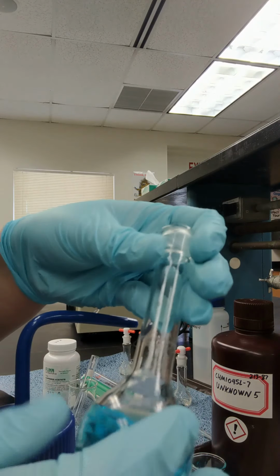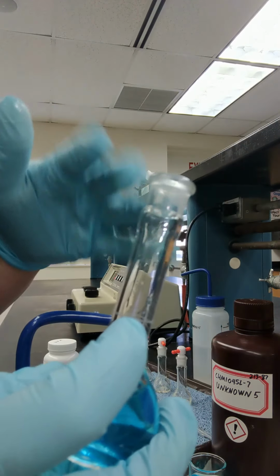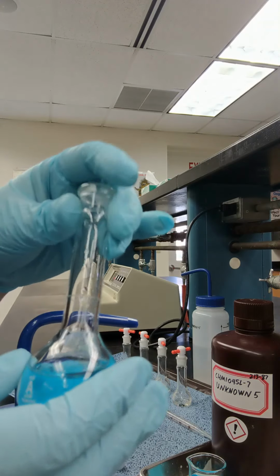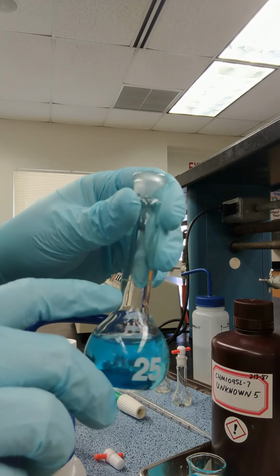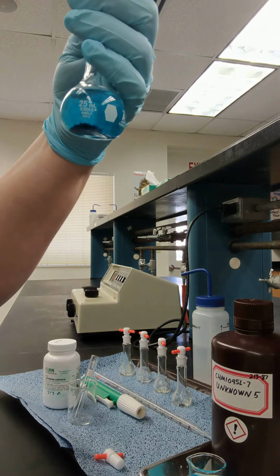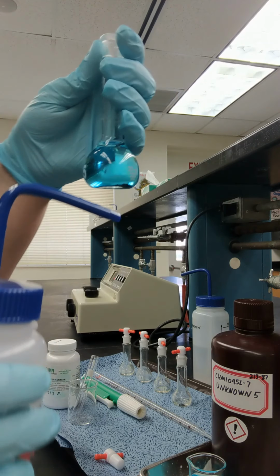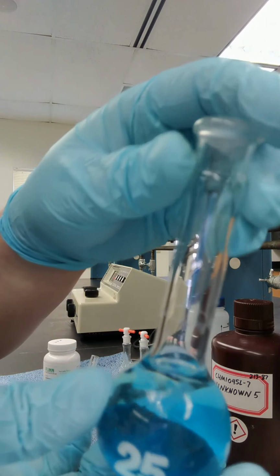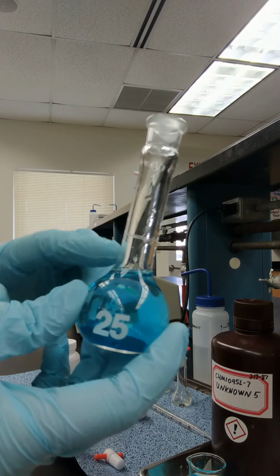Your volumetric flask has a calibration line. It's right here. Okay. So that's the volume marking for 25 milliliters. That's the total volume that we want. Okay. So total volume for your solution. I'm going to add some more water, but not all the way to that line. The reason is that you want all the solid to dissolve before completing the volume to that 25 milliliters line. So I'm going to add some water. You can see that I didn't go all the way to the line. I still have some amount empty there.